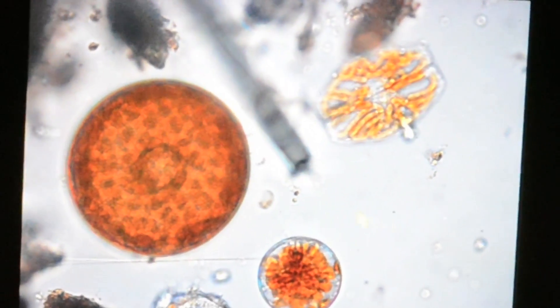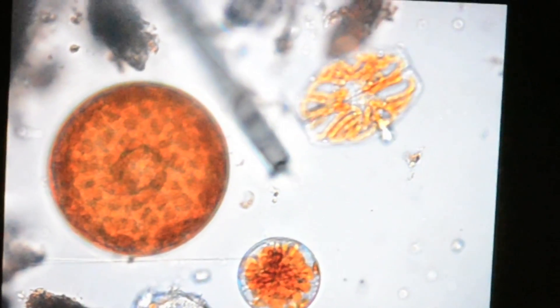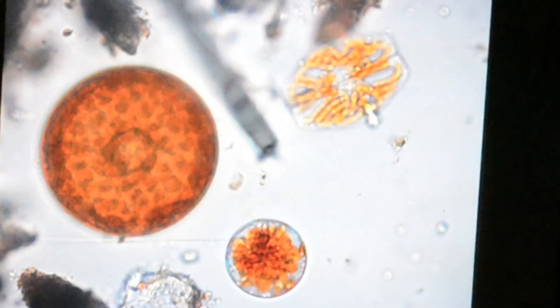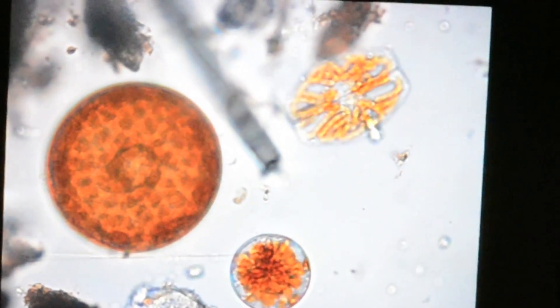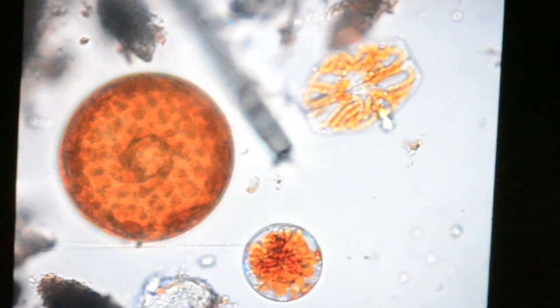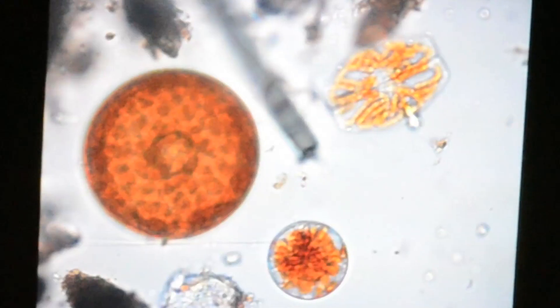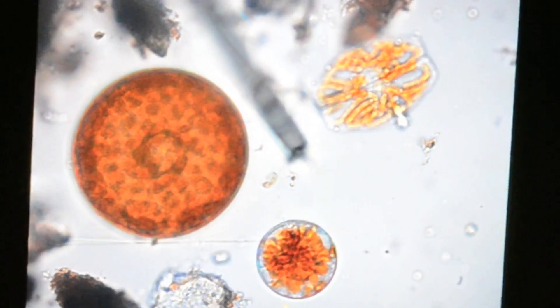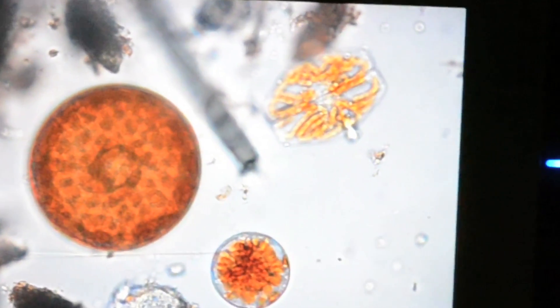As I go through, I'll see a lot of different species. Usually every day there's approximately five to ten that are very dominant. But in addition, I might see one cell of another ten. So between 20 and 25 different species are found in each sample.